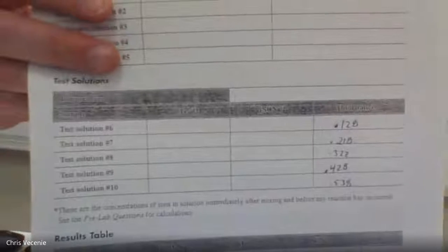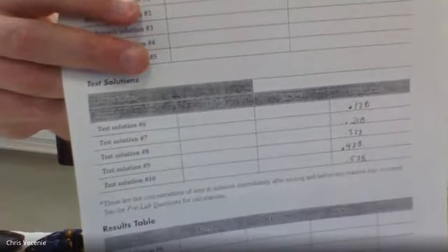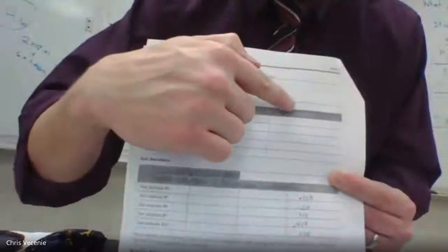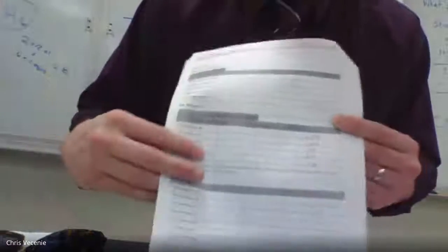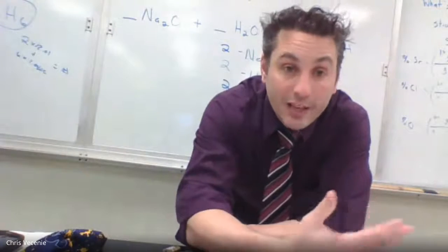And like I said, for the other 2 columns in this table, if you look back into your pre-lab, number 3 of your pre-lab is showing you a dilution problem, M1V1 equals M2V2, and that is where all the numbers that are in here come from. I gave them to you from the colorimeter, pre-lab question number 2. I gave it to you from the colorimeter, pre-lab question number 3. When you get down to here, now you're into post-lab questions. You have to create your Beer-Lambert plot. You'll get these from your Beer-Lambert plot, and then post-lab questions, I think number 4 and number 5, get you to fill these in. So you'll have all sorts of math on a different page, and you'll end up just transferring it into that results table.